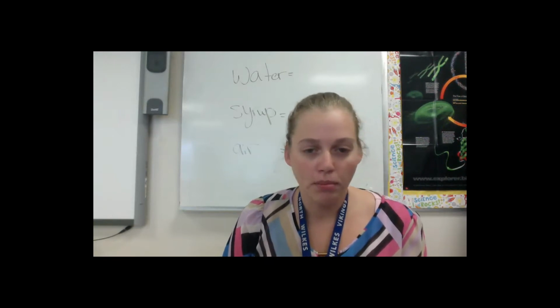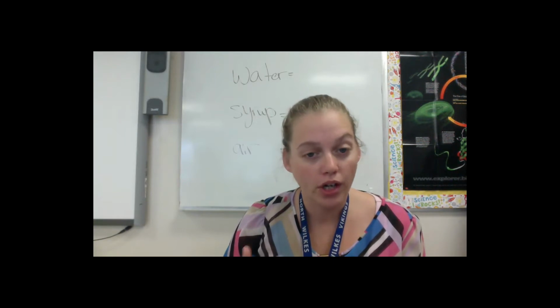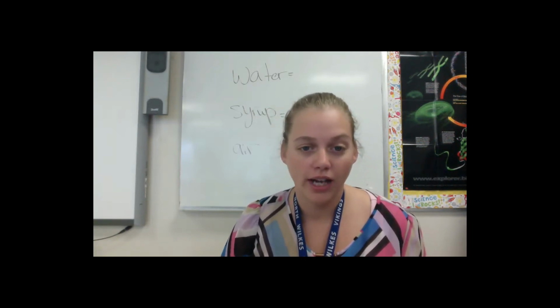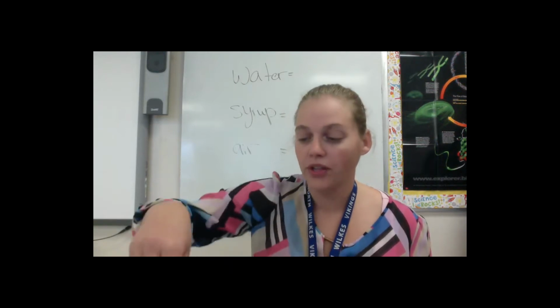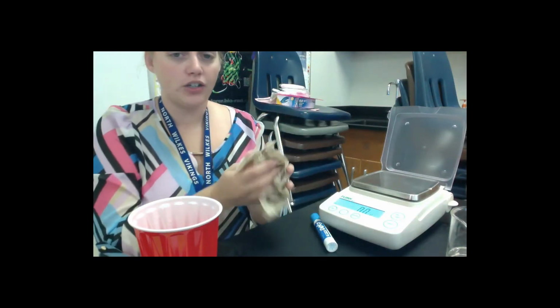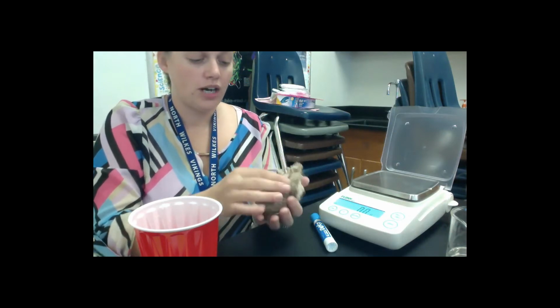Now, before I put these eggs into their solutions, I'm going to want to weigh them, because I want to know what their mass was before I put them into the solution, so I can see how the solution affected their mass afterwards, and then hopefully determine what goes across this membrane. So I'm going to weigh my eggs, and here I have my scale, and I will record those weights behind me on the board. Now, I do want to make sure that I'm just weighing the egg. I don't want to be weighing the water or the vinegar. So I'm going to dry it off.